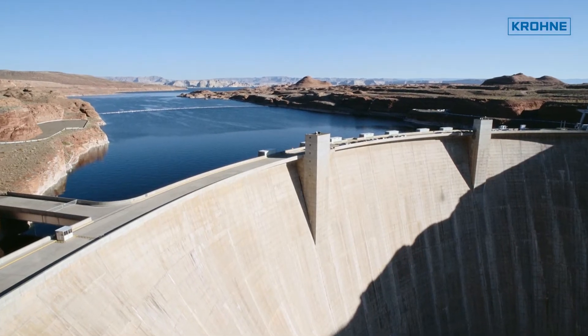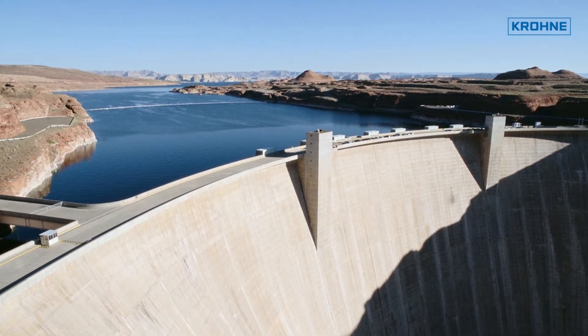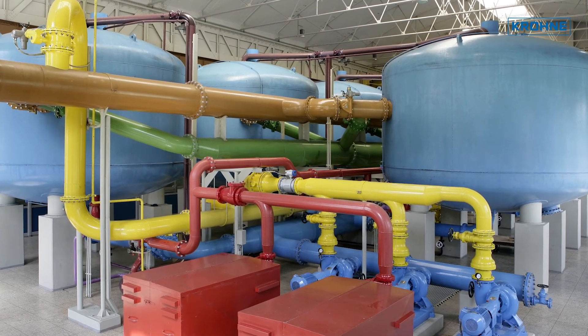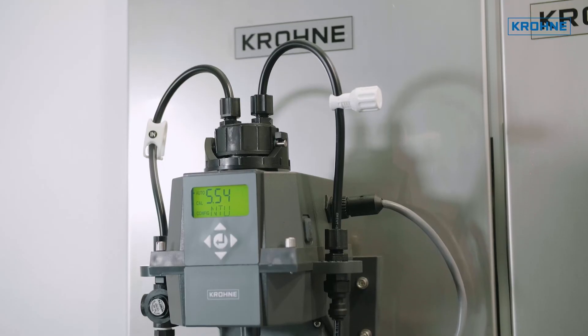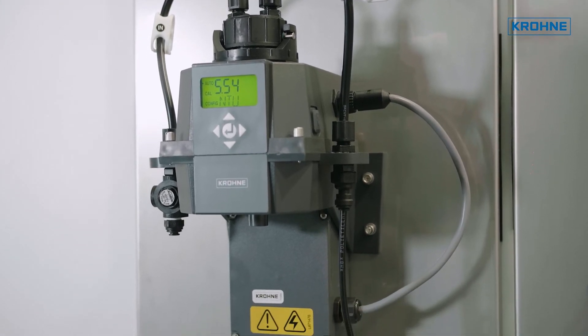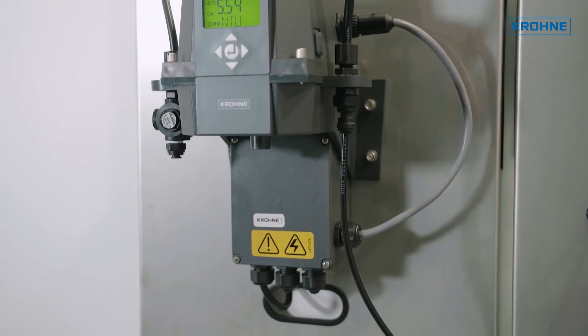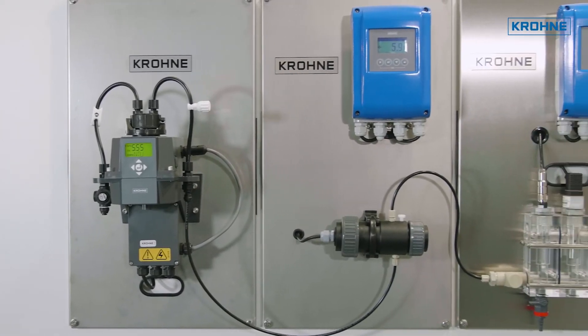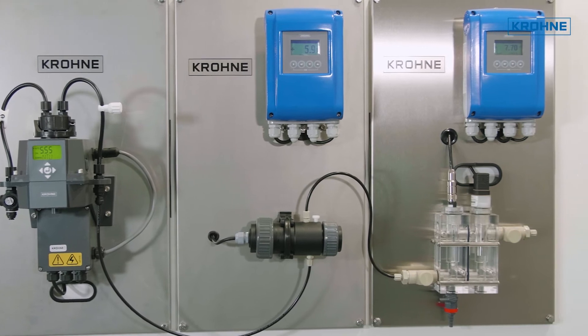Customers from the field of drinking and process water treatment in particular appreciate the central installation, where all relevant measuring parameters are visible and positioned directly next to each other. When monitoring filters or controlling cooling and process water, the system solution also shows advantages over having measuring points scattered across the plant.